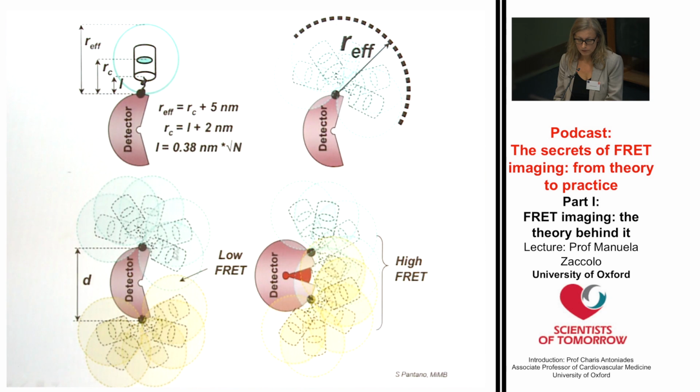And the two need to separate enough not to have any overlap in the absence of FRET. So there is some room to play with in deciding the length of the linker, and there are ways one can estimate the overall end-to-end dimension of a peptide linker.